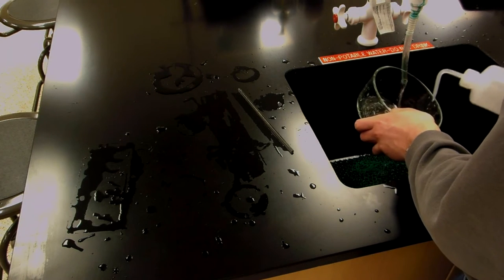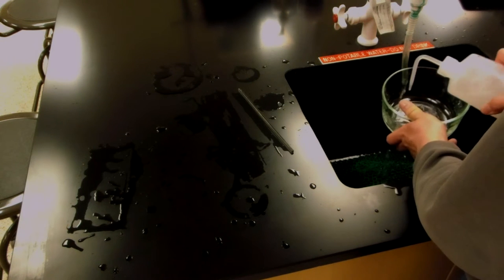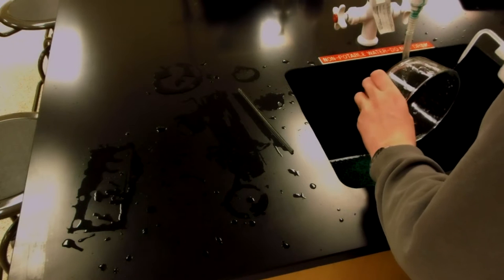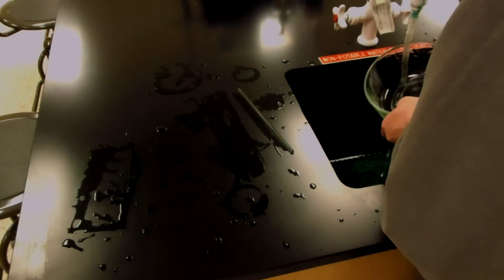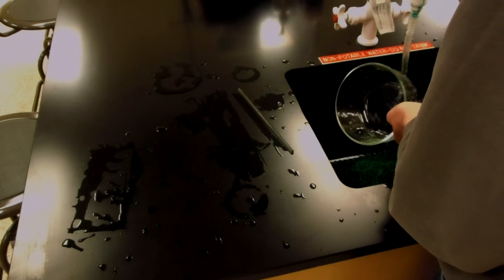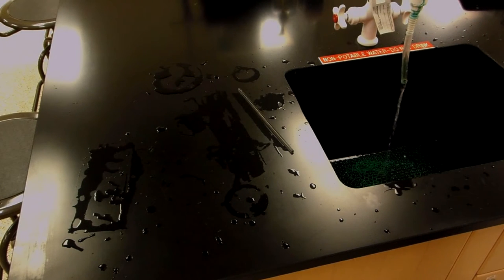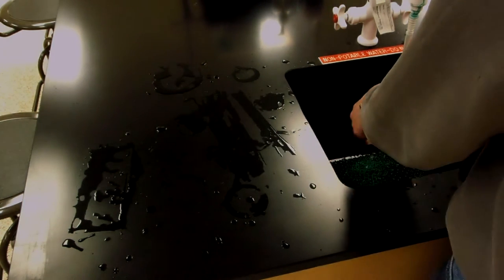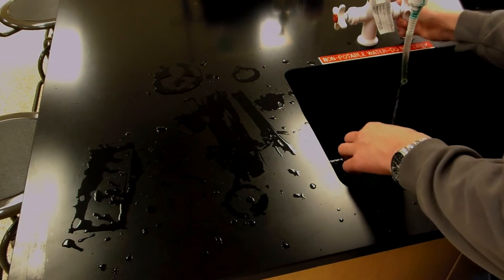So, as you can see, I just washed the inside. So now I'm just washing the outside again. And when that's done, I will now wash and rinse the last glass rod. And I'm done with the rinsing step.